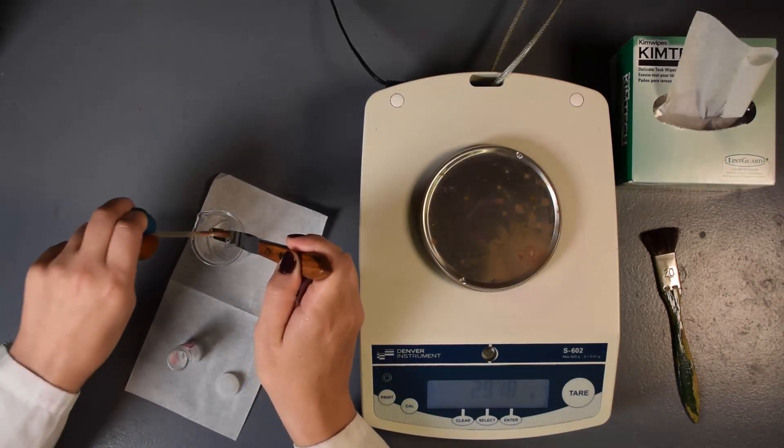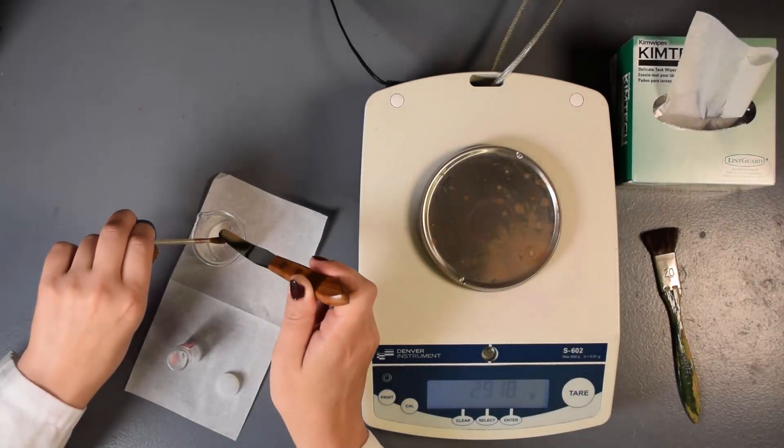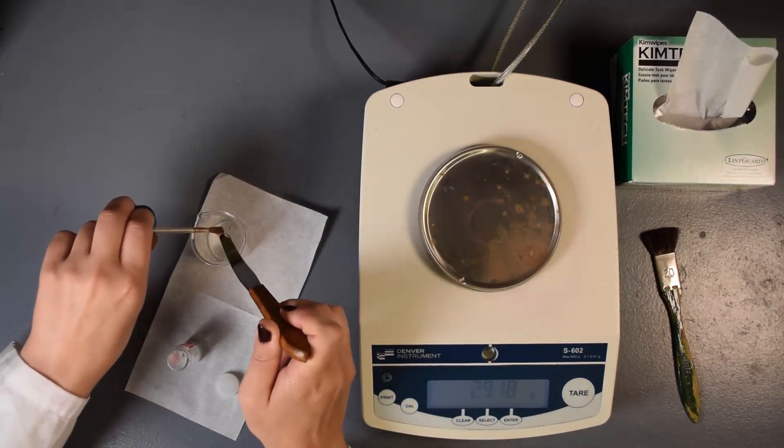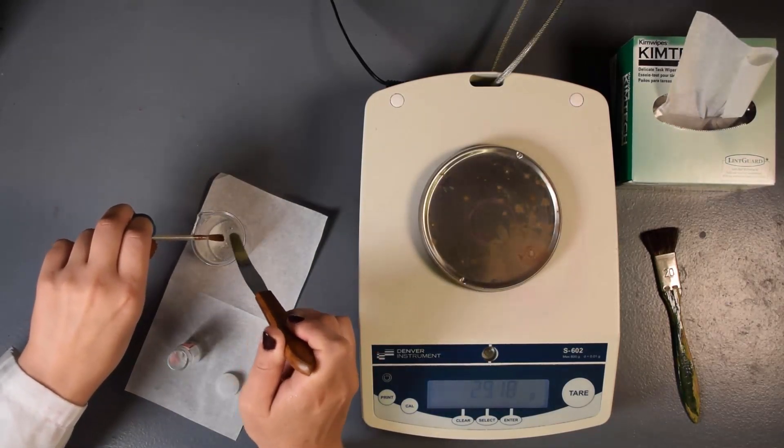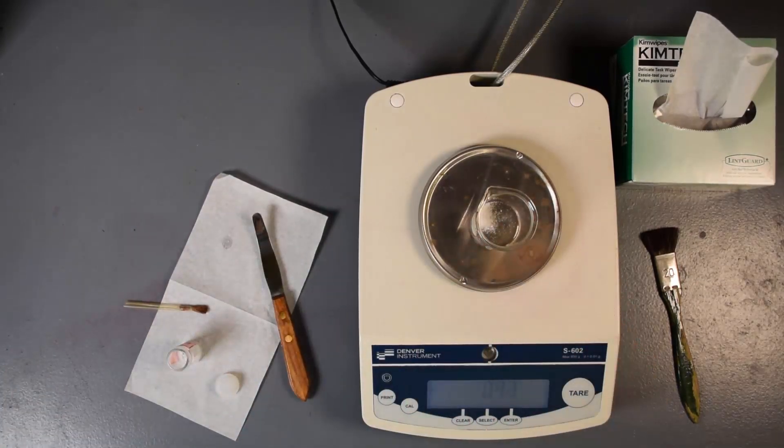It is critically important to achieve a quantitative transfer and not lose any compound outside of the beaker or container. Make sure the spatula is at or below the top of the beaker when brushing with the camel hair brush so that all the compound is brushed into the beaker and not onto the bench top. Reweigh the beaker on the top loading balance.